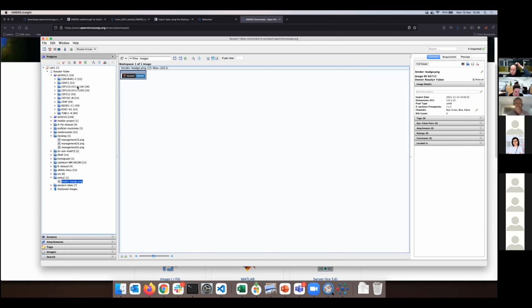You have also then another option, and this is to use our demo server. Demo server is a server which we keep kind of indefinitely, but again, you can't import gigabytes, terabytes of data there. It's kind of free for all. And we reserve the right to delete your data without notice because it's a demo server. For real, sustained, protected work, you have your Turku server.